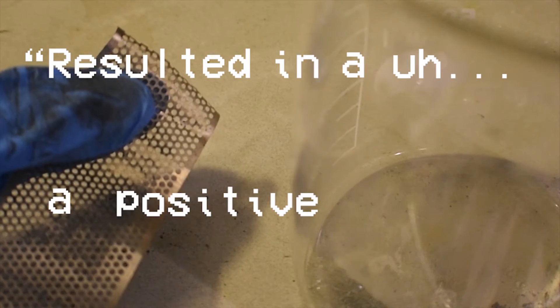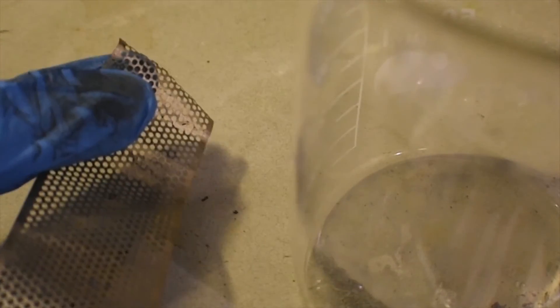Before we convert the cadmium into a salt, I should mention this piece: I thought it was cadmium at first, but it turns out it's just iron. I found this out by dissolving it in both hydrochloric and nitric acid, and then performing the thiocyanate test, which gave a positive result — it turned rose red or blood red, indicating iron was present. So this isn't cadmium; discard it. Now let's move on to making the salt.